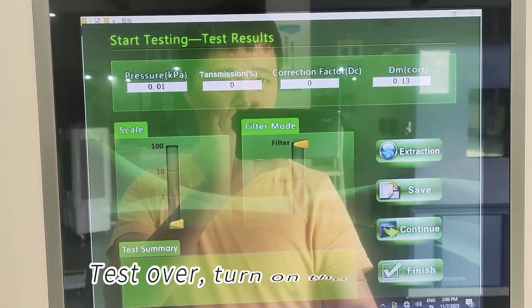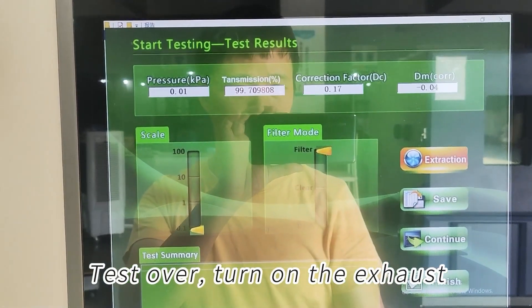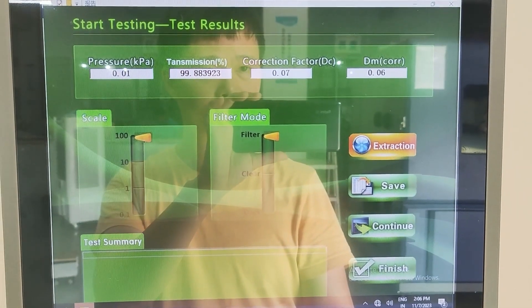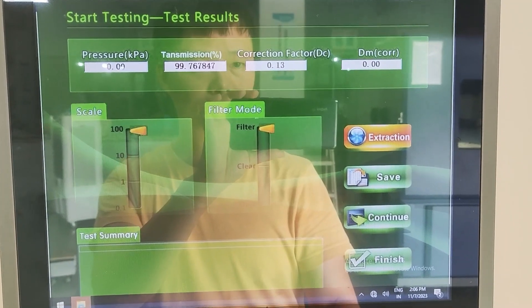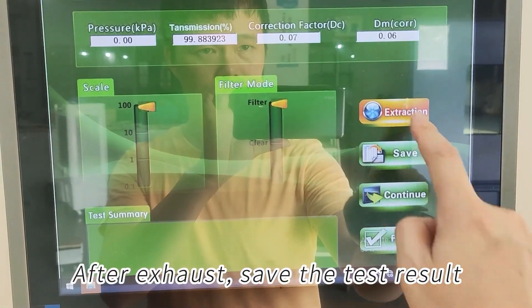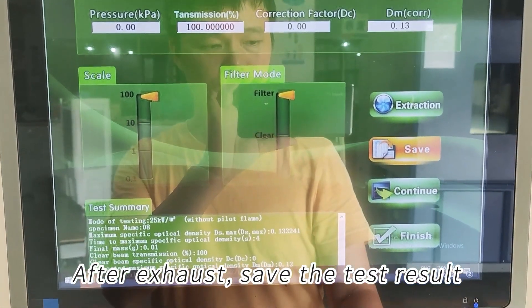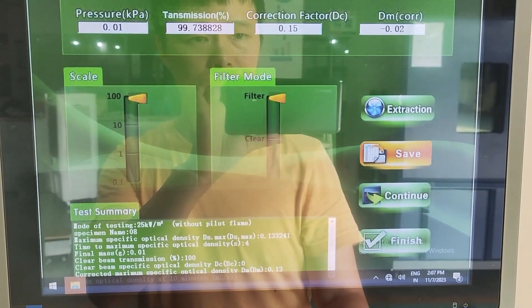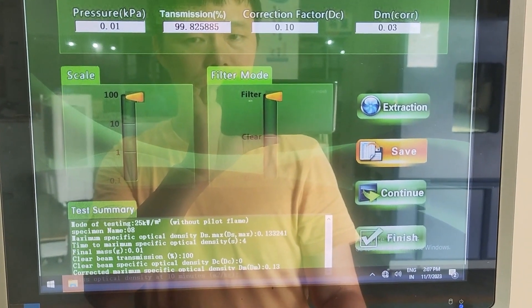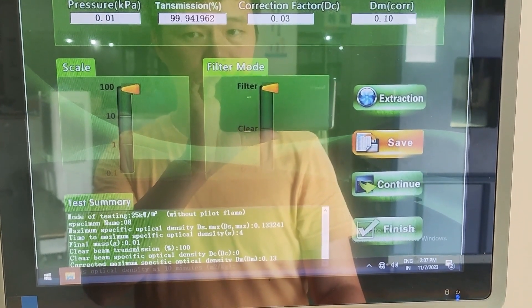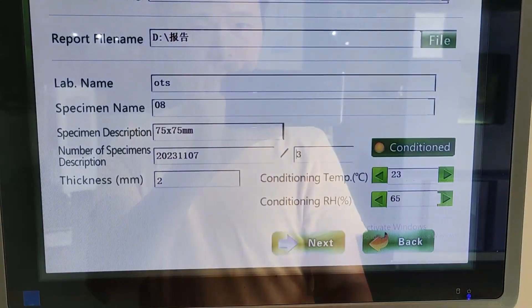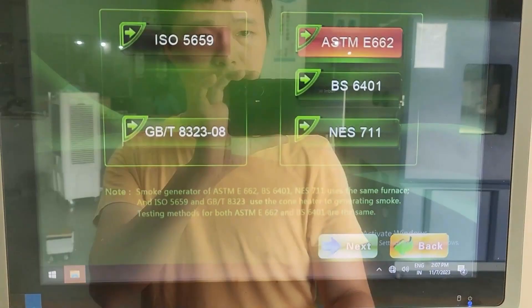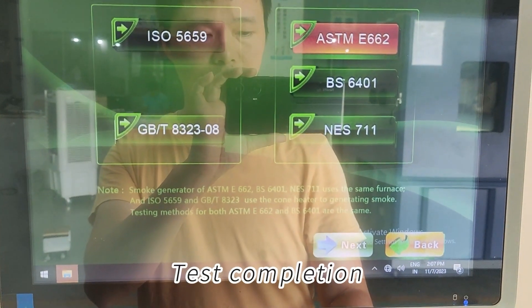Turn on the exhaust. After exhaust, save the test result. Test completion.